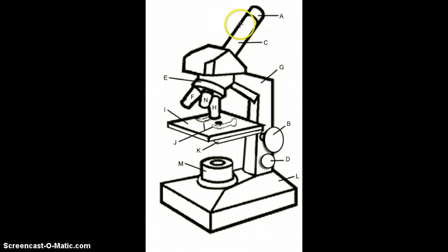A right here is the eyepiece. This little tiny thing is called the eyepiece, you look through that. This long rod right here is called the body tube.